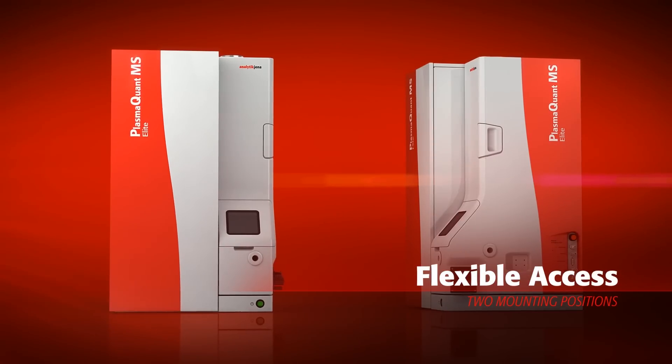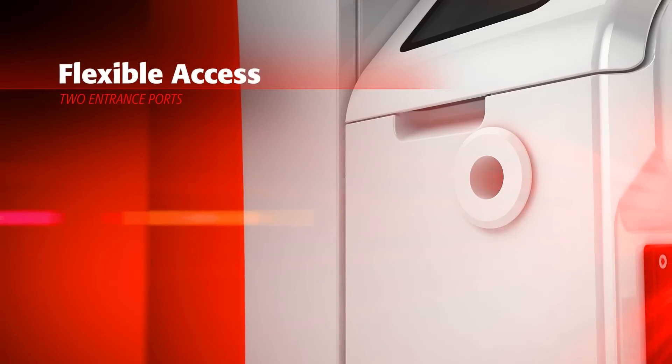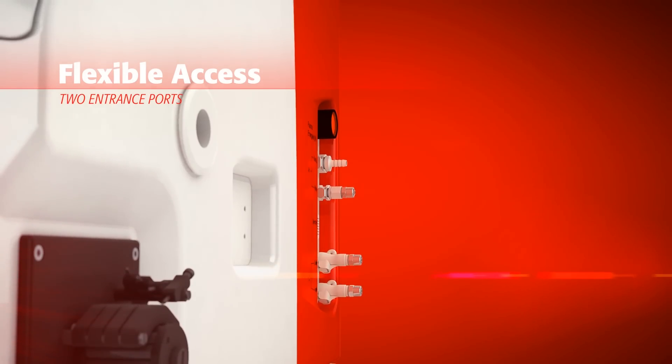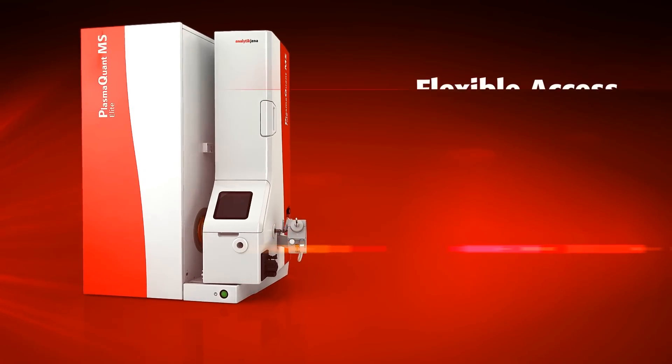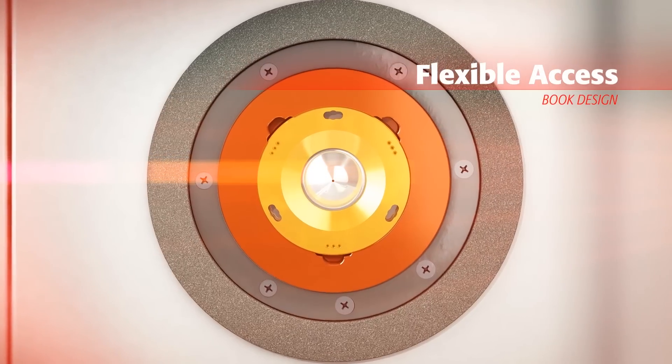The twin-position bench-mounted design includes two entrance ports, offering you complete flexibility in configuring the system to your laboratory requirements. Full open access makes maintenance a breeze with the clever book design.